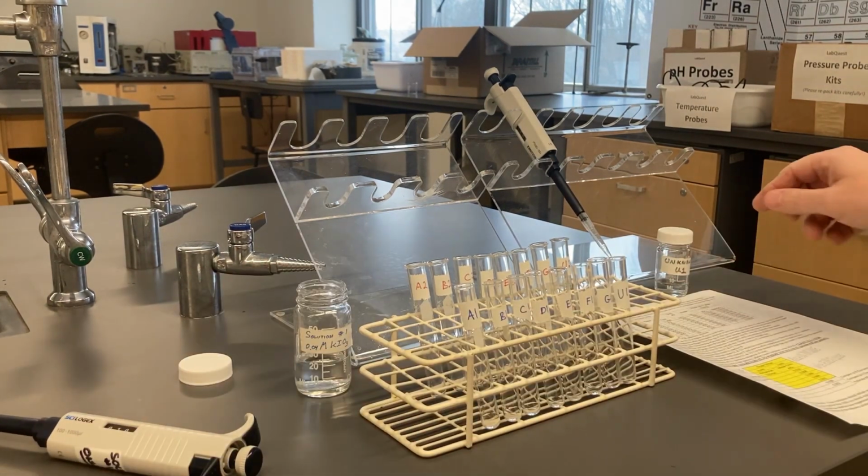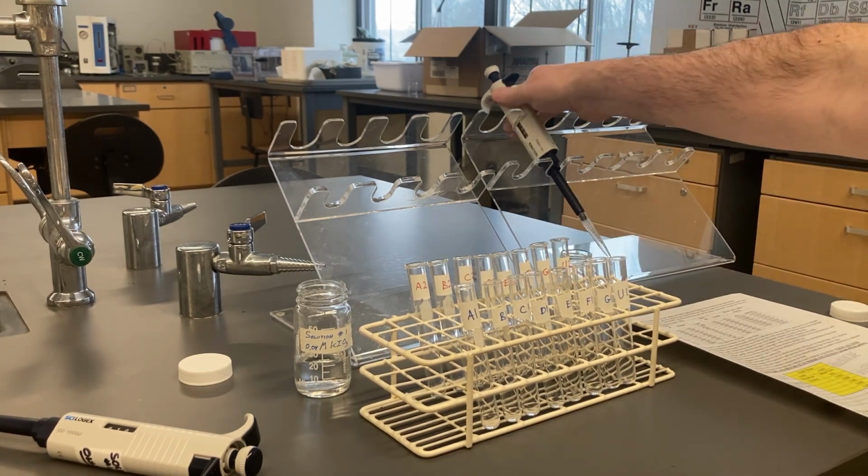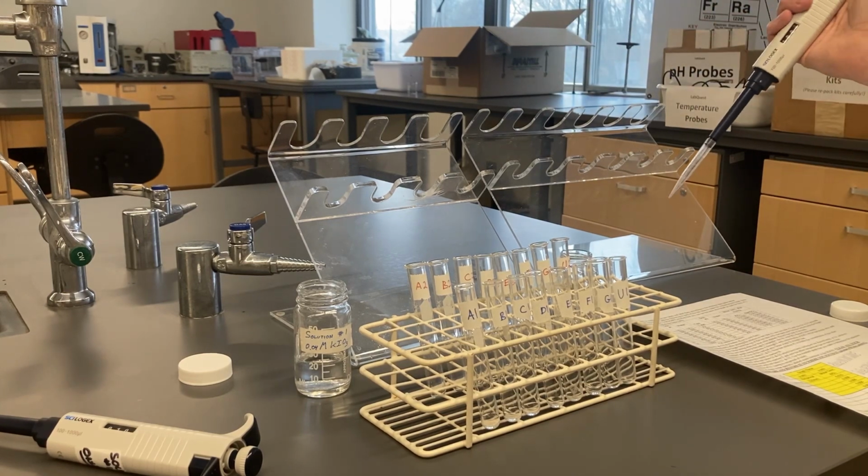Now U1 is going to be the unknown, and so that's just going to get a full 1,000 microliters of the unknown here.